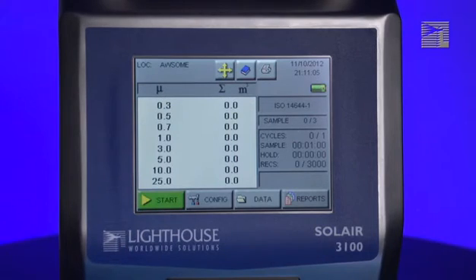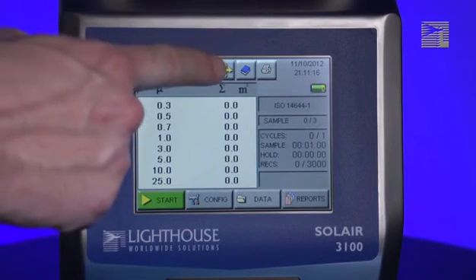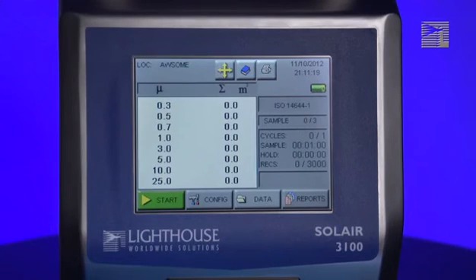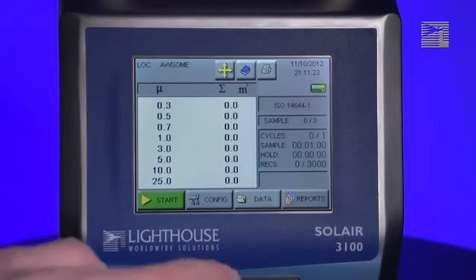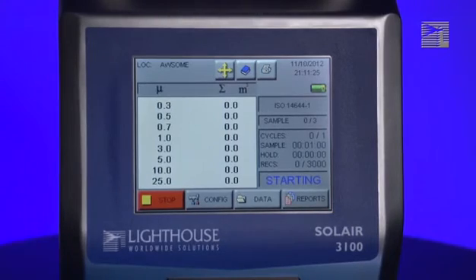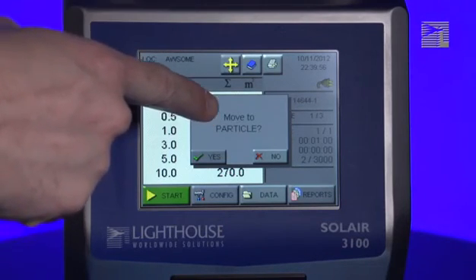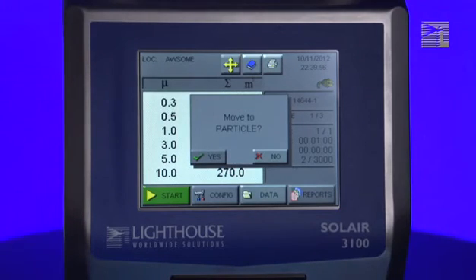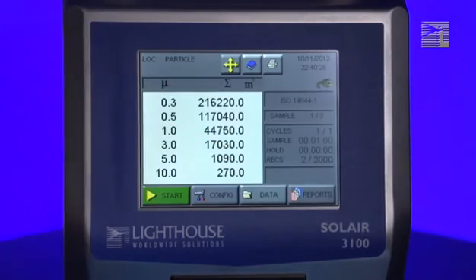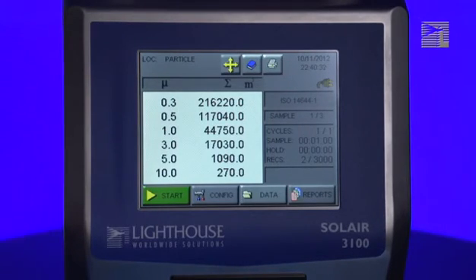Before starting the report, walk to the first sample location and set the sample location on the instrument by pressing the Locations button, which shows four arrows facing up, down, left, and right. To start running the report, press the Start button. The instrument will sample at the current location until the sample is complete. Once the sample is complete, it will prompt you asking if you want to move to the next location in the Locations list. If you wish to take the next sample at the prompted location, press the Yes button — the instrument will automatically change the selected location for you. Walk to that location and when ready, press the Start button.